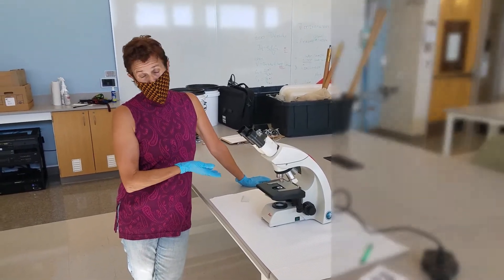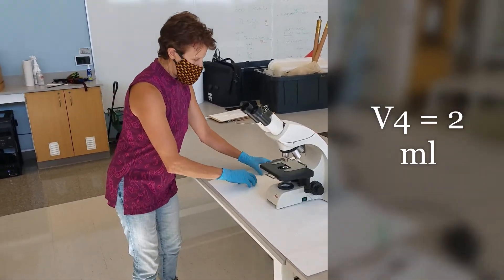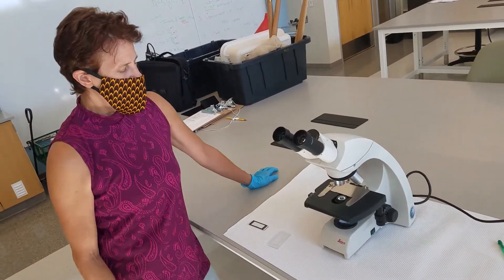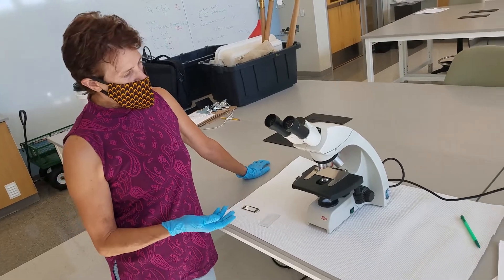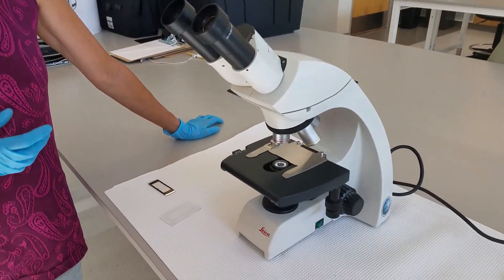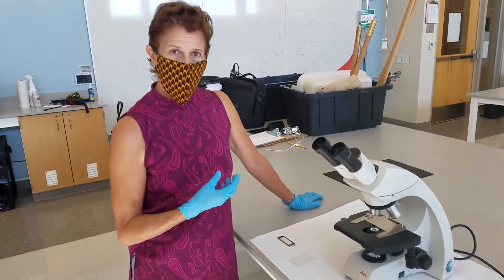We've got our two sample slides prepped — there they are. And we have these nice light microscopes, and so we're going to magnify so that we can see.